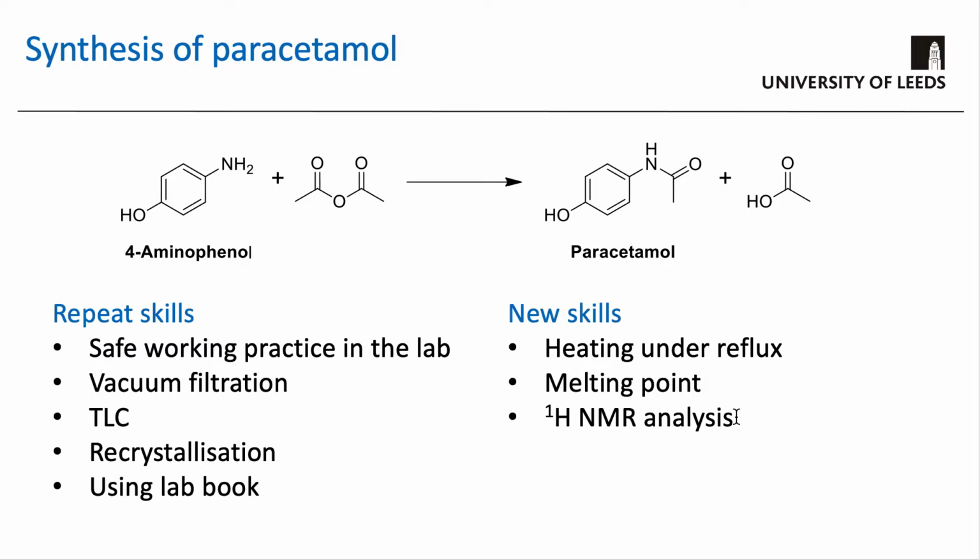You'll be submitting an NMR sample of your paracetamol to stores, and they will run them on the school NMR machines, and you'll get your NMR spectrum back for you to analyse and work out if you've got the correct structure. NMR is probably the main technique for working out the structure of organic and inorganic compounds, and something you'll learn a lot through the theory modules on the course.